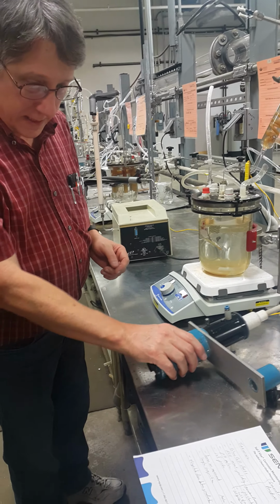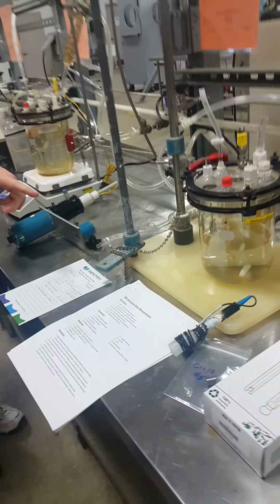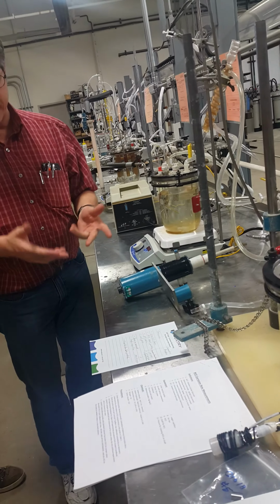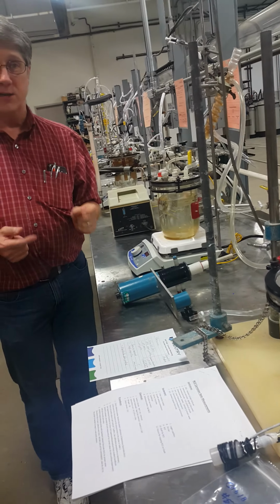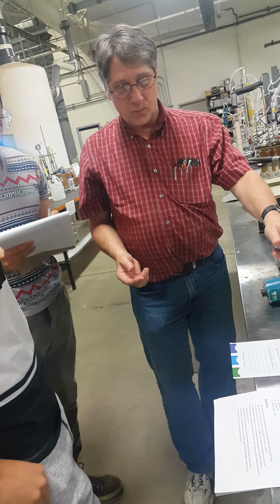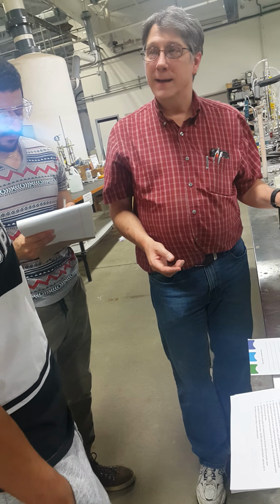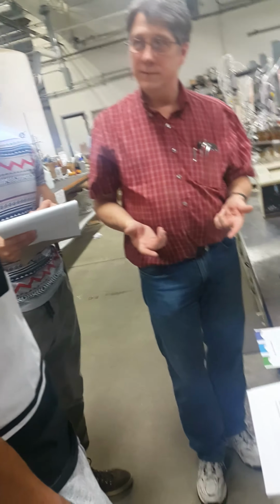Okay, let's see. So glass cell parts. You've got to have a stir bar in the bottom whenever you start mixing, whenever you put things together, because one of the things that we actually saw, that I had to chase down and figure out what the problem was, is that when you put your salt in, even heating it up is not always enough to fully mix the salt into the solution.